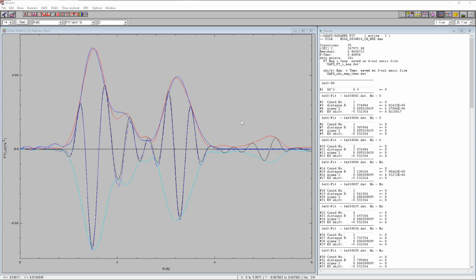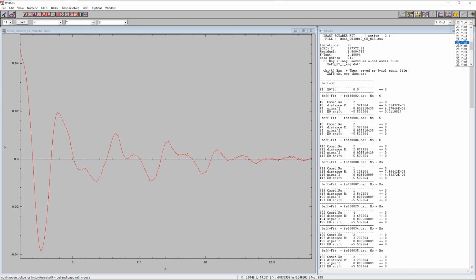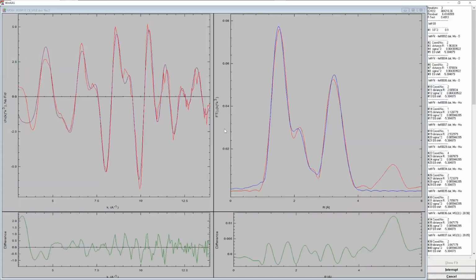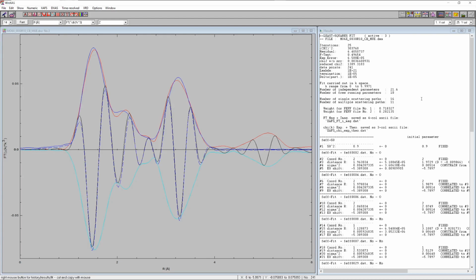So before we actually do the analysis of the entire series, let's test our macro with another column, let's say column 25, and we're going to just run the macro, the XAFS fit macro that we just created, and get this result. So now if we look at the fit parameters, actually, we see that the concentration of the two phases has changed. So although those were kept invariant in the macro set to 55 and 45, apparently here now they have changed.